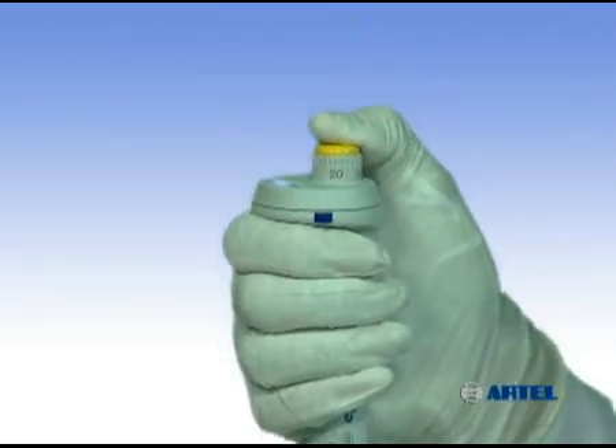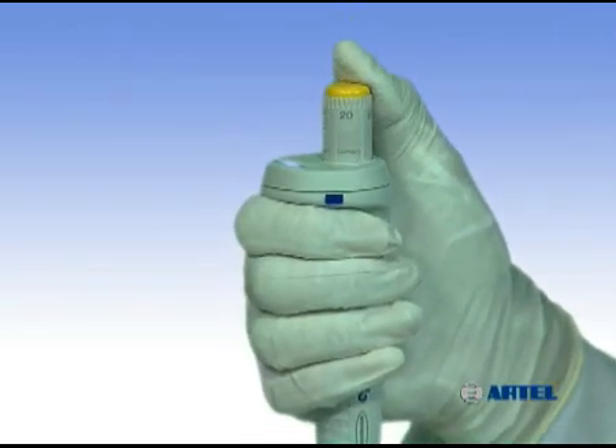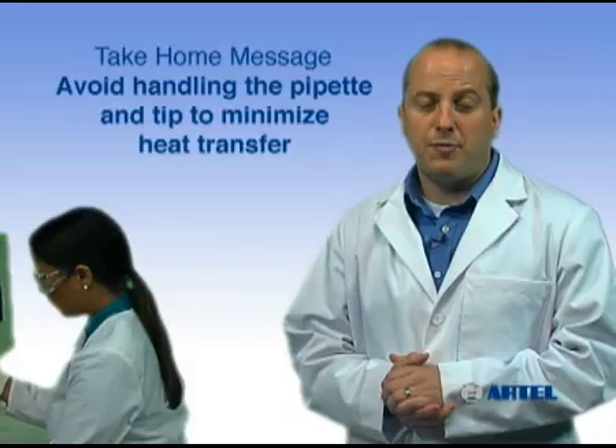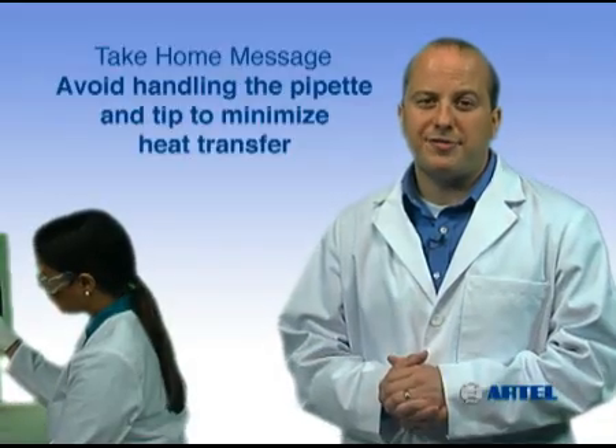One way to reduce heat transfer is to wear gloves. The take-home message is: minimizing heat transfer, such as by not overhandling the pipet and the tips, will help reduce errors in volume transfers.